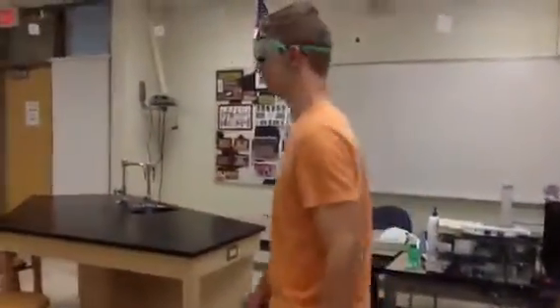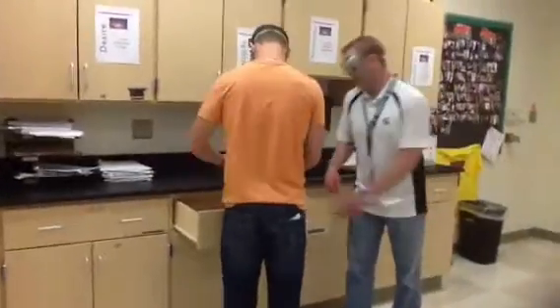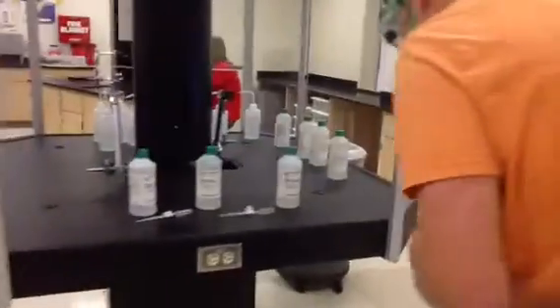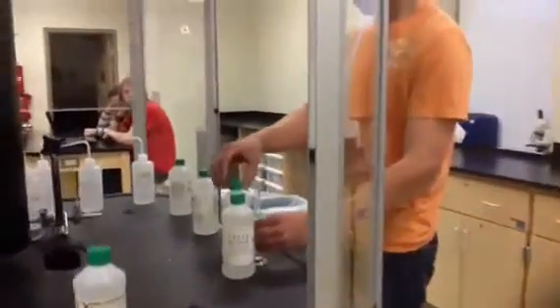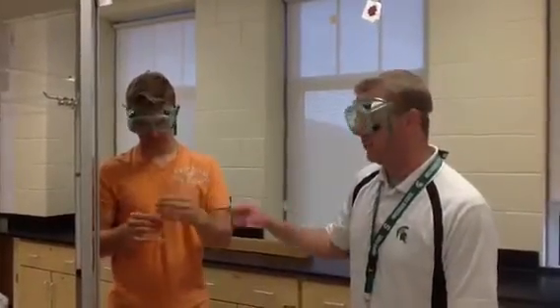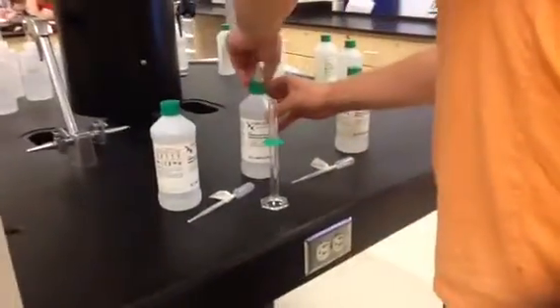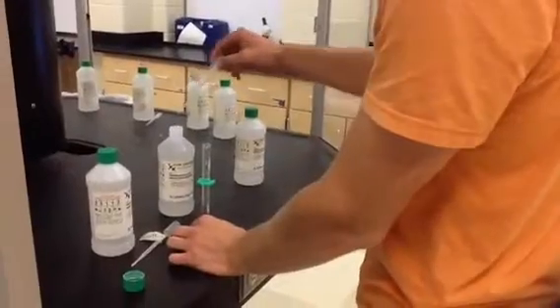Next he's going to get a graduated cylinder. Graduated cylinders are located right here — he's going to get a small one, a 10 milliliter graduated cylinder. He's then going to go over to where the acids are, which are underneath the hood, and measure off 5 milliliters of acid. He's going to put the phenolphthalein in with the acid in that same graduated cylinder.